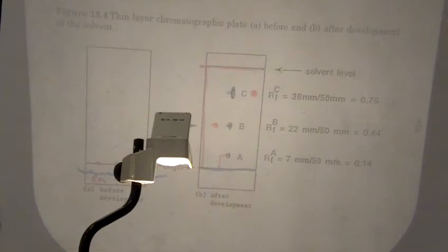So we're going to have TLC standards that you spot on your TLC plate along with your reaction mixture or your final product: the starting material, the N-phenylmaleimide, and the final experiment 12 product, after you've gone through the Diels-Alder reaction. So you'll have a standard of each of those, so you can use that for comparison to figure out which is what spot on your TLC plates, okay?